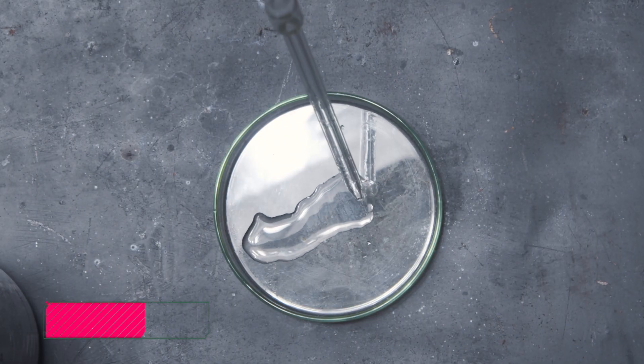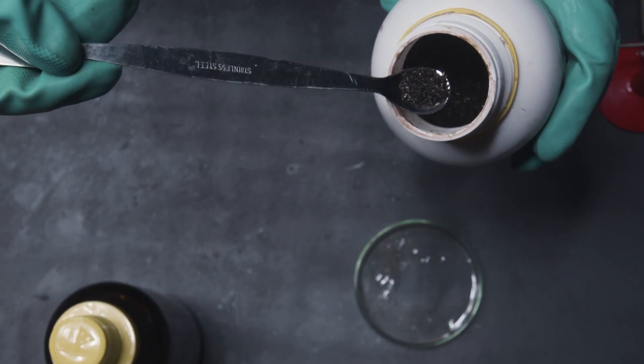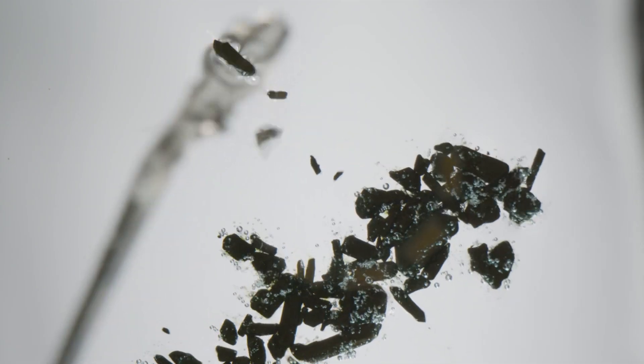Take a pipette of concentrated sulfuric acid and put it in a petri dish. Then you want to mix in a small amount of potassium permanganate to it.